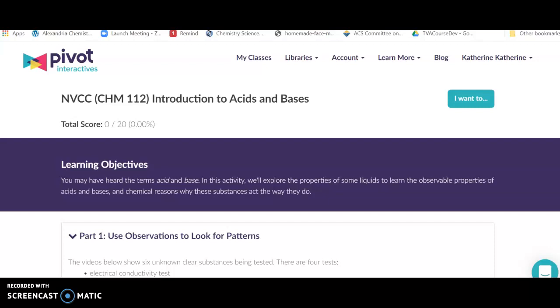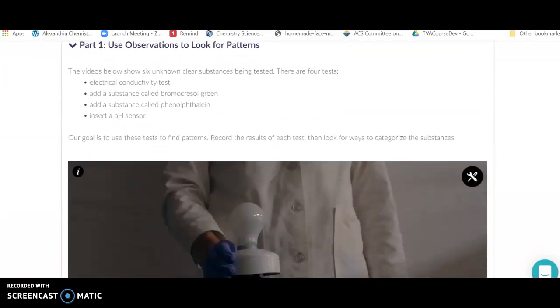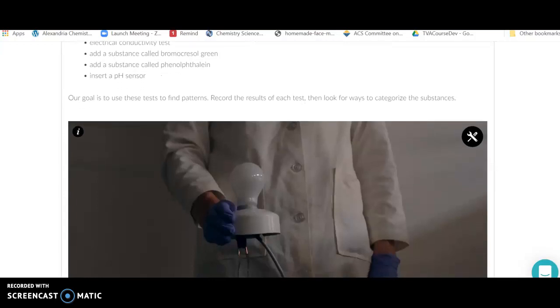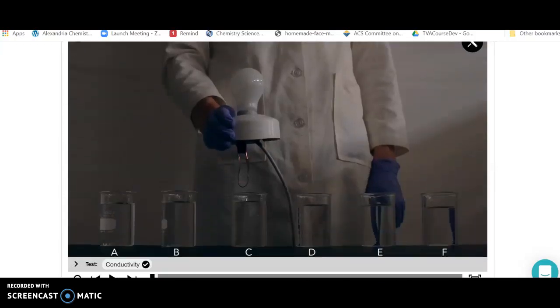This is the Pivot Labs. In order to introduce you to acids and bases, we're going to start out by looking at just some patterns. What we're going to consider are a couple of indicators, bromocresol green and phenolphthalein, an actual pH sensor, as well as electrical conductivity.